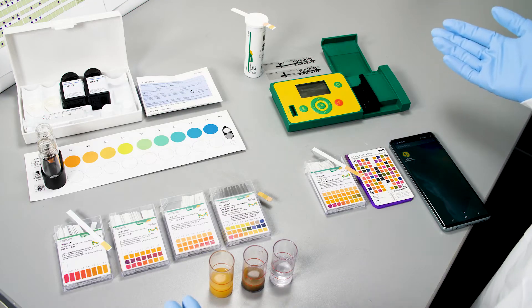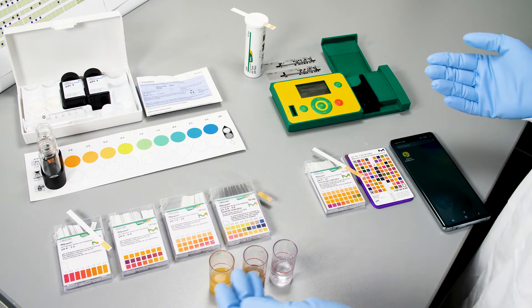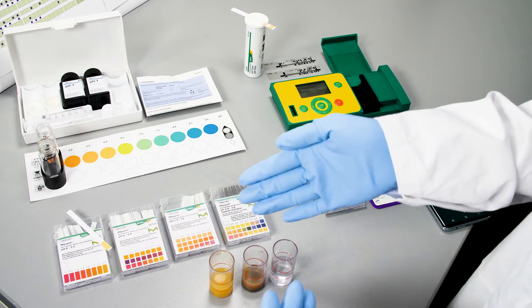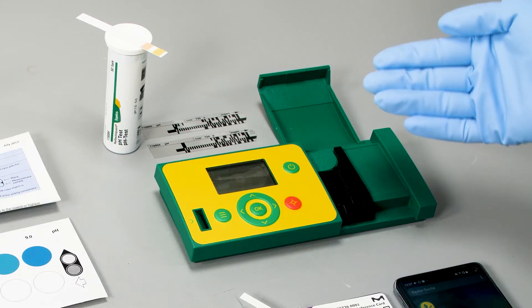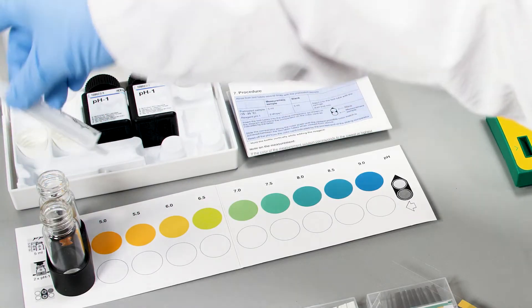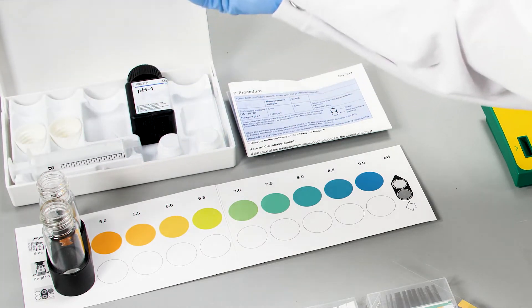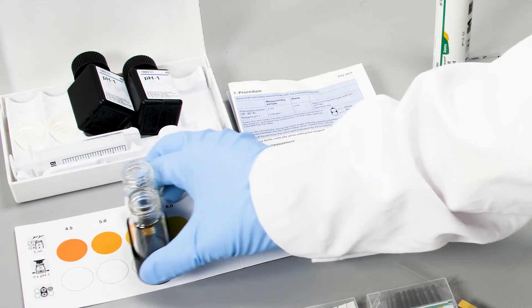Here I have a variety of different options to measure pH with visual and instrumental readout, both semi-quantitatively and quantitatively. We have the option to read out liquid samples, test-strip readout, test-strip readout with smartphone, and quantitative readout with the test-strip reader. Let's start with Ampoint Liquid. If you have liquid samples, you can measure the pH by putting your sample into the vessels with a syringe and then creating a color reaction of your sample and comparing it to the colors given on the color card.